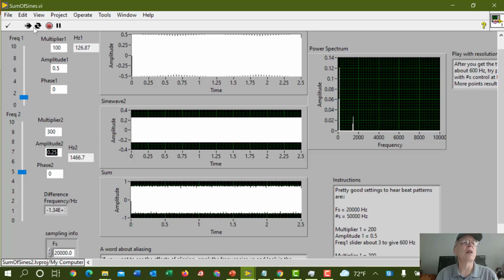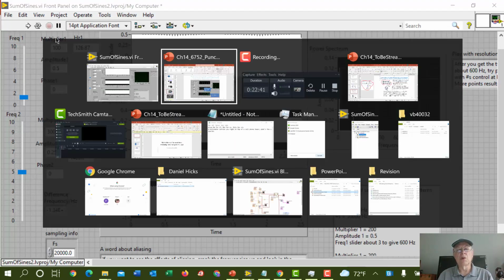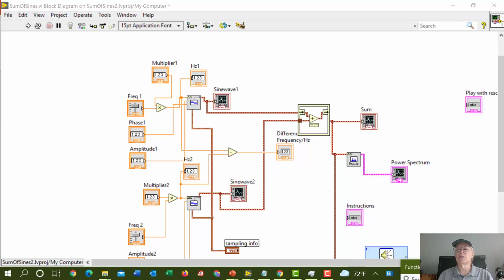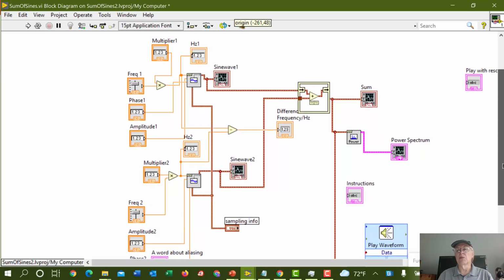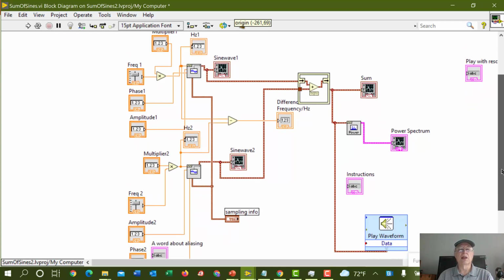Okay, well, I'll stop this. And I think what I wanted to do, I wanted to show you the language that that's written in, which I have here on the screen. This is the code for what you just saw. And you see that it's not anything about it written. This is a software program called LabVIEW. It's very powerful. It's a little weird. Electrical engineers like it. You can see it's laid out a little bit like a circuit diagram.